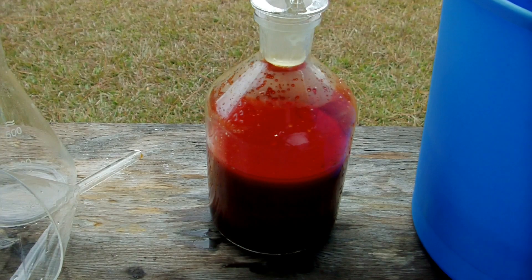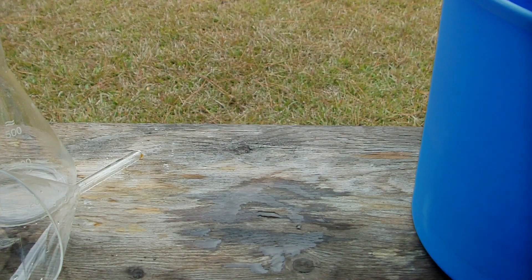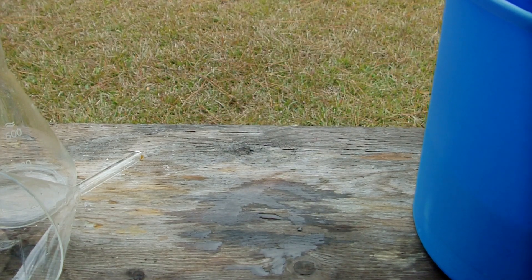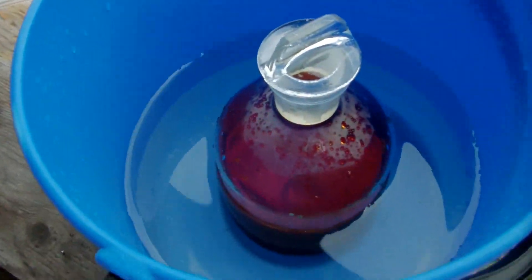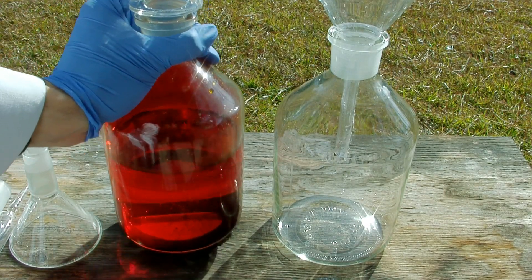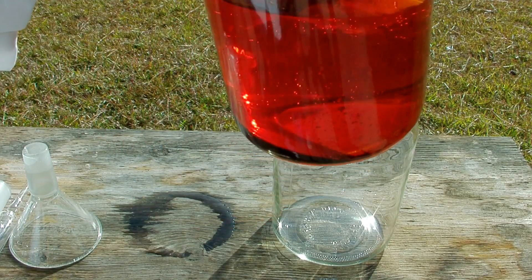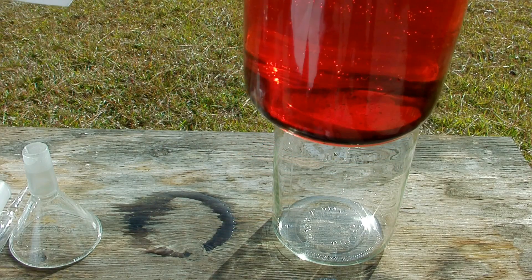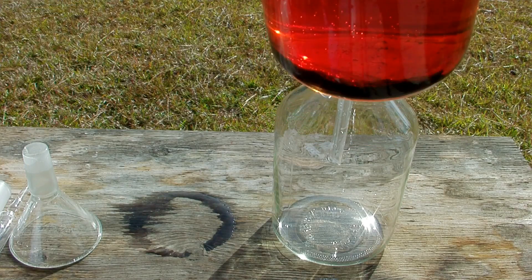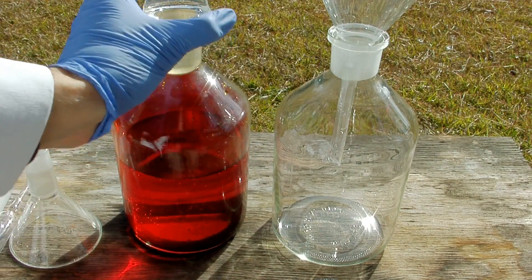Now that all the acid has been added, I'm going to put this into the cold bucket and let it sit for a while. Hopefully all the bromine that's in there is going to coalesce into a blob on the bottom of the solution.